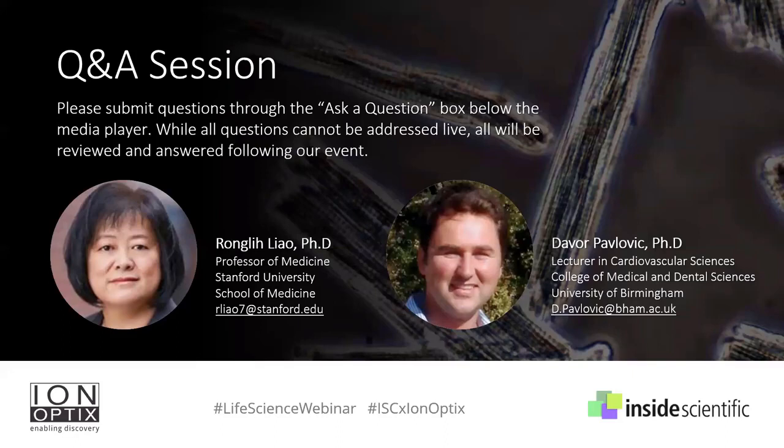I think try and error a couple of times, observe what you got, and take notes every time you make changes, and then you will see the improvement. I always recommend people to do, on purpose, a shorter time to see what the underdigested heart looks like, and a longer time to see what the overdigested heart looks like. And you find your own timing in between under and over. That's your perfect sweet spot.